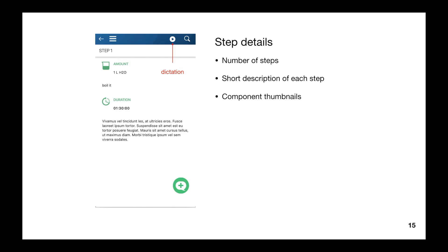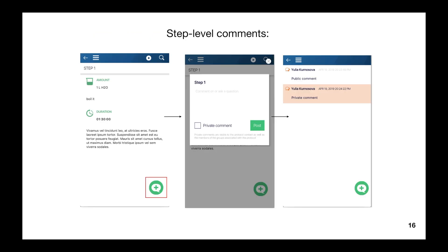If you want to read full step information, just select the exact step. The structure of the step detail screen is similar to our website — it contains ordered components. The step detail screen also contains a dictation mode, which you can run by tapping a small button at the top of the screen. If you want, you can add a step-level comment by tapping the plus button. In the comment screen, you can set privacy: private comments are visible only to the protocol owner and you, while public comments are visible to all users.